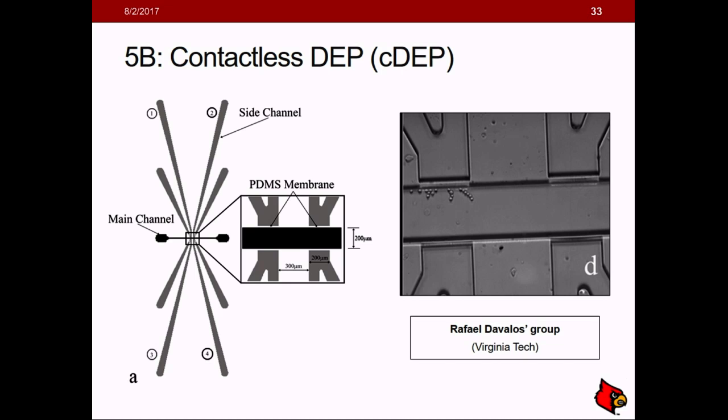And then because of that, you have your electric field propagating through the depth of your channel. So the height of these liquid electrodes is not planar anymore. The height of these liquid electrodes is the same depth as the main channel. Now the one thing that needs to be considered is this barrier.